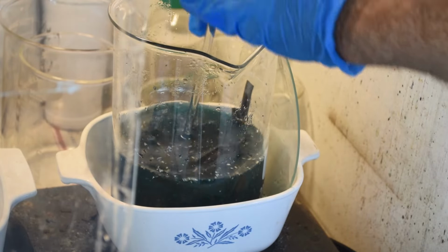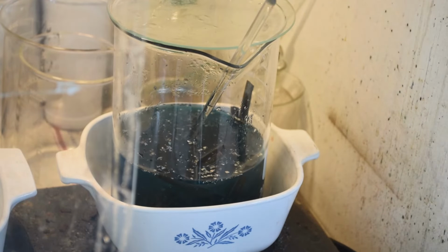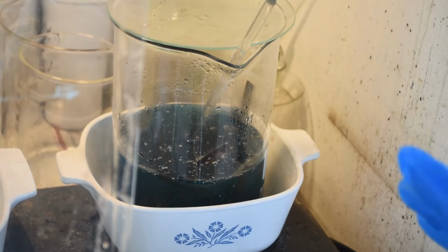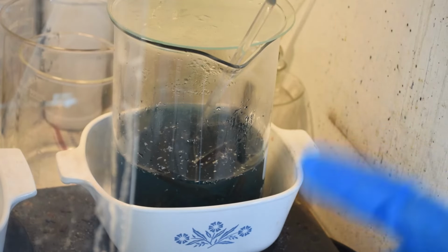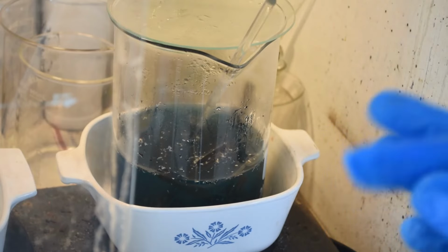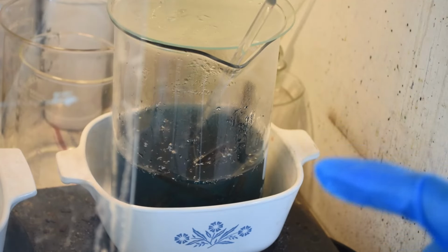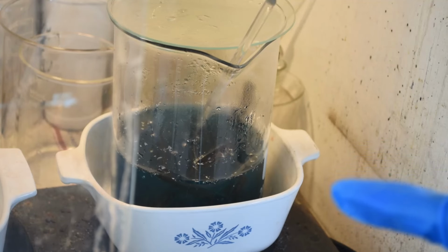I'm going to let it all cool down because it's still hot, and probably tackle that tomorrow. And then once I've got the palladium foils separated, I can dissolve them separately. Or not, I don't know. Joven wanted a way to separate the palladium from this stuff. I'm not sure I want to dissolve it and then try to reprecipitate it. I have to think about that, and maybe do a little research in the good book, Hoke's Precious Metal Recycling book, and see what the best way to get palladium back out of solution is.